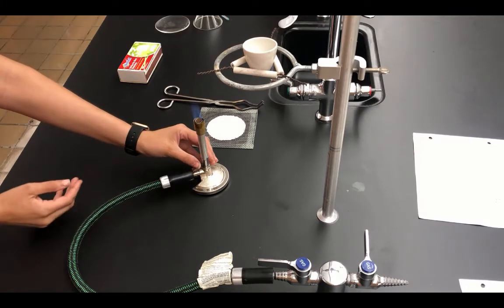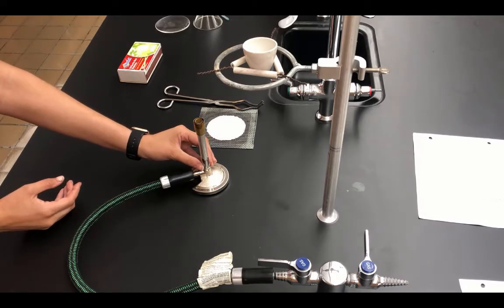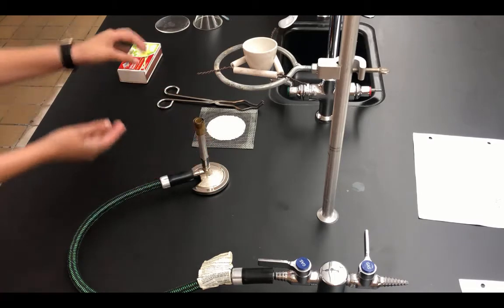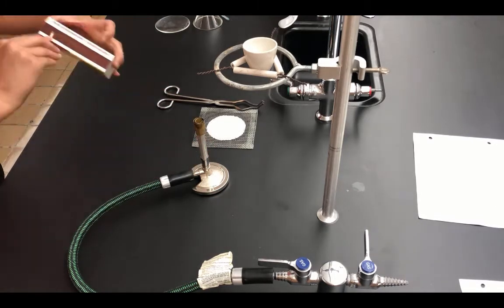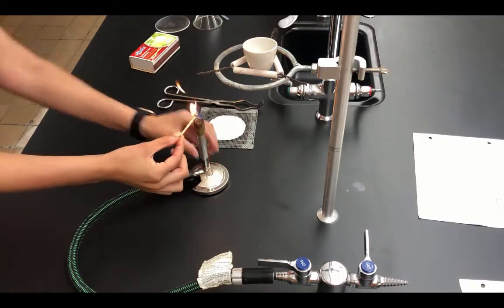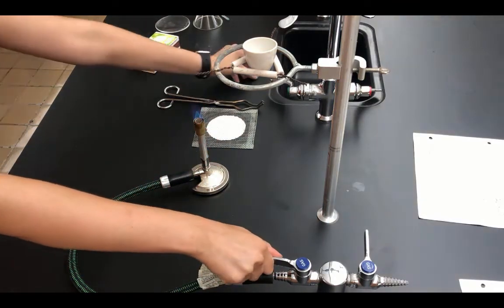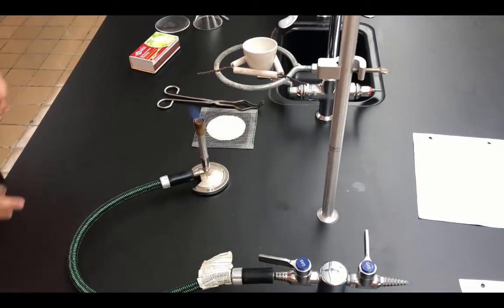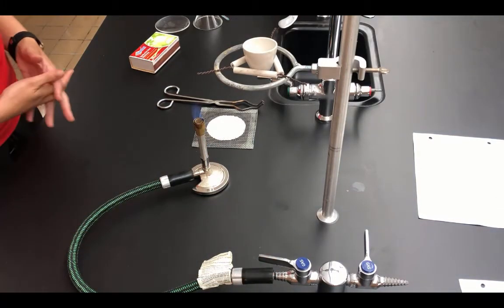Once you have the flame, you can adjust. Now notice when I adjusted it, it was too much and it went out. So I'm going to close it again. Light the match, come up from the side. What I might have to do is adjust the gas just a little bit. If you notice that it starts to go out, then just leave it like it is. And so now I have the Bunsen burner set up.